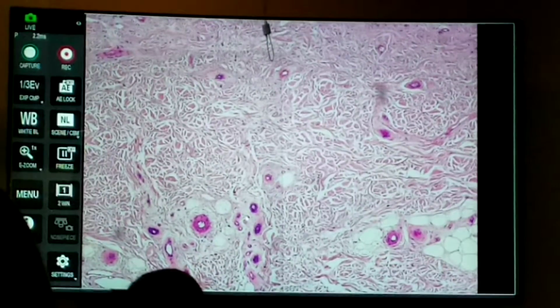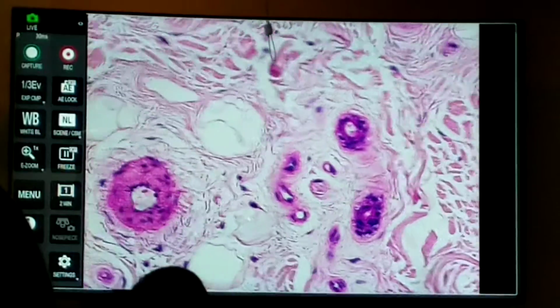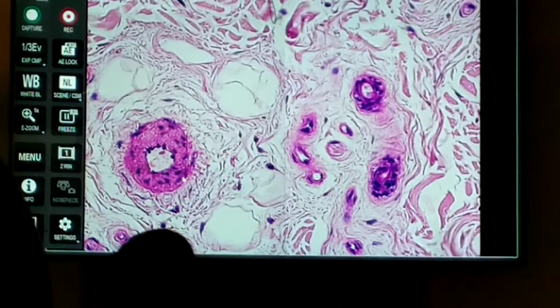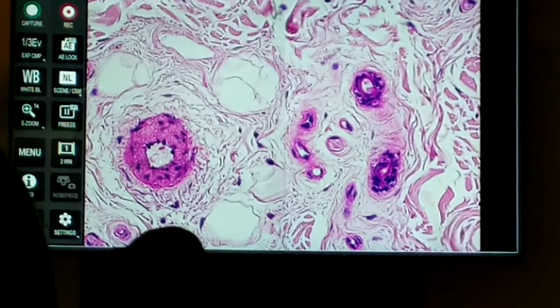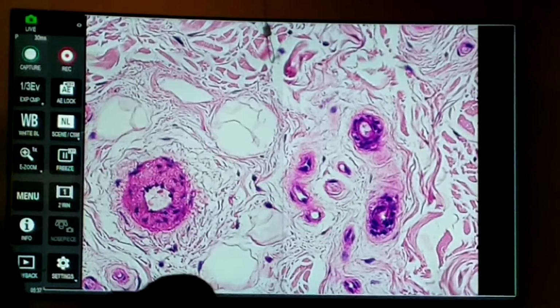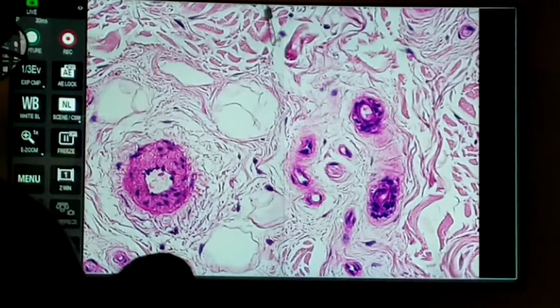So question for you. Put this in the center. Is this a sweat gland? No, this is a simple squamous epithelium here that's lining a little bit, that's got red blood cells in it. So this is a little arteriole. On the other hand, this here, that has at least 2 layers of cells lining a smaller lumen, this is a duct that's extending up. In fact, this is part of the same duct that this is part of. It's just weaving in and out of the planar sections.